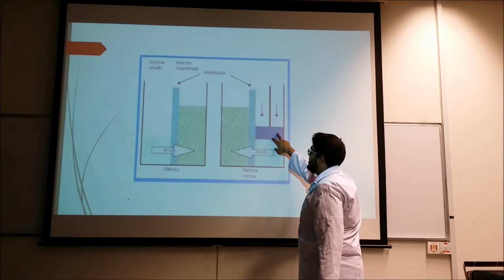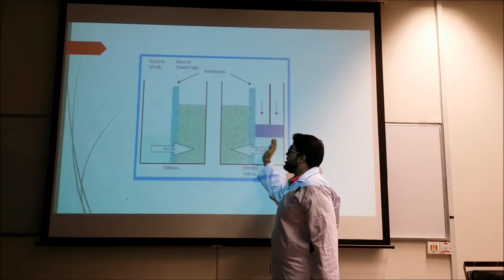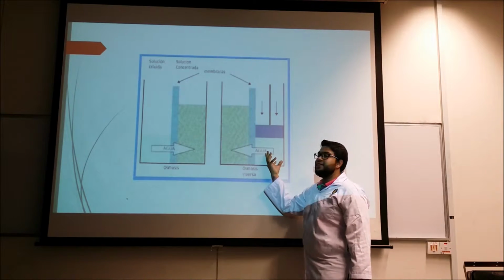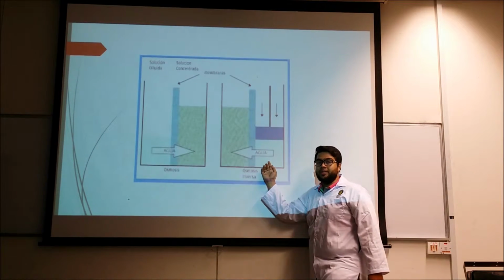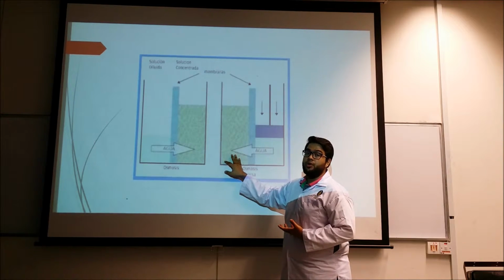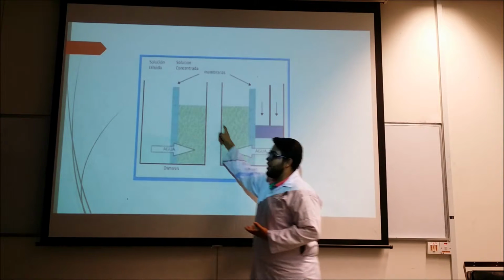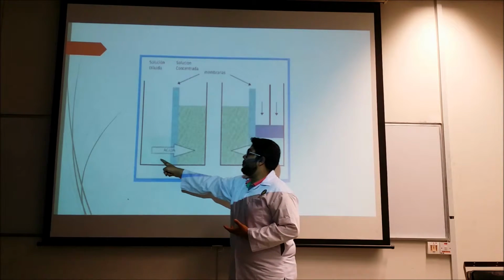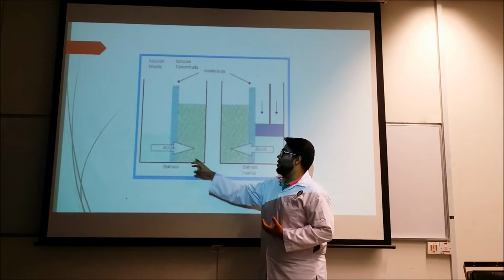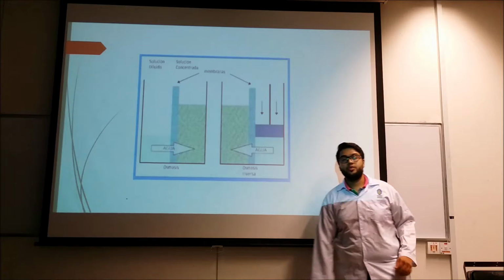Then pressure is applied so that the water is squeezed through the thin membrane. The only thing left behind is the undissolved solid particles, and this is almost pure water. Then it is transferred to another chamber and compressed again to get clearer, better water out of the raw water. So this is the first step we apply in the reverse osmosis system.